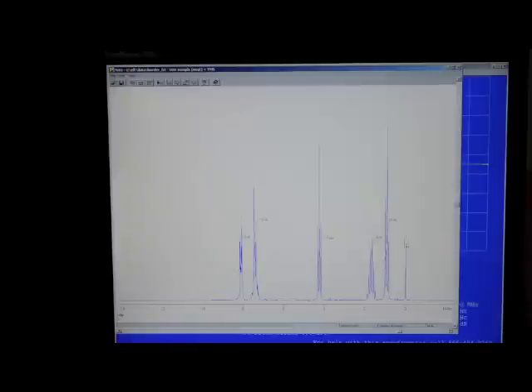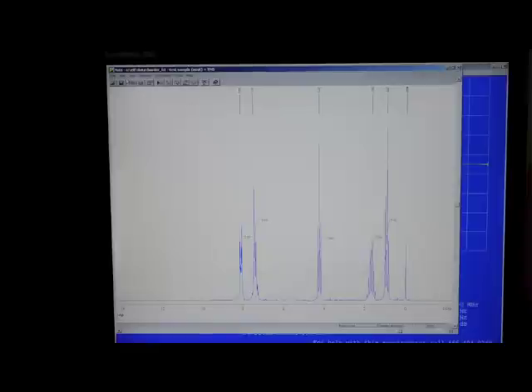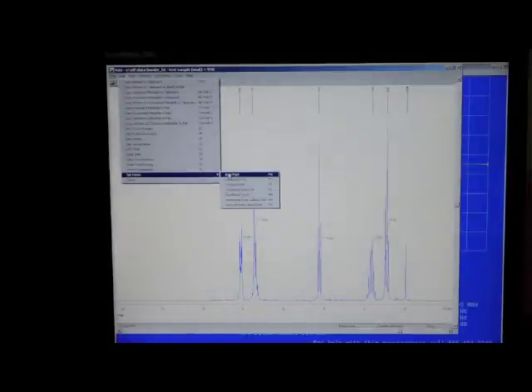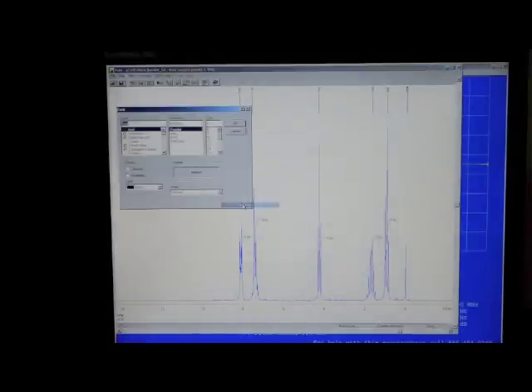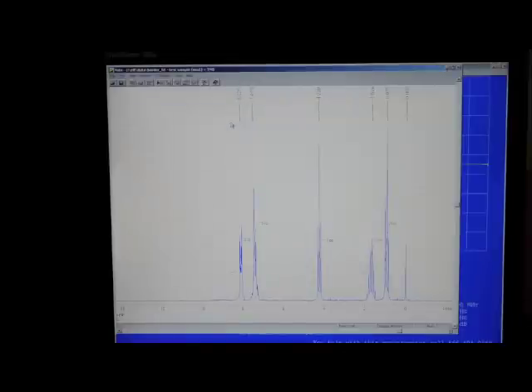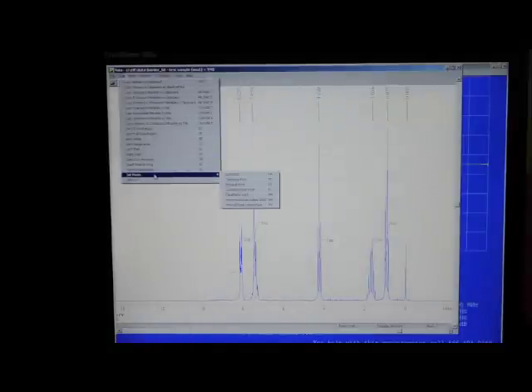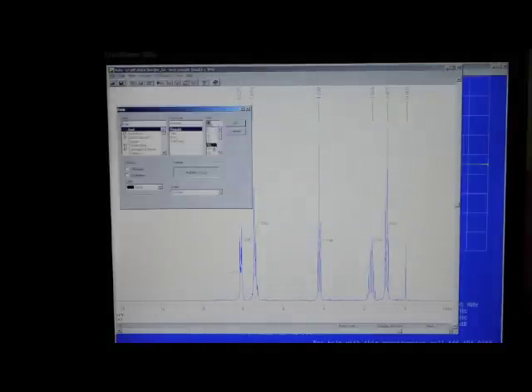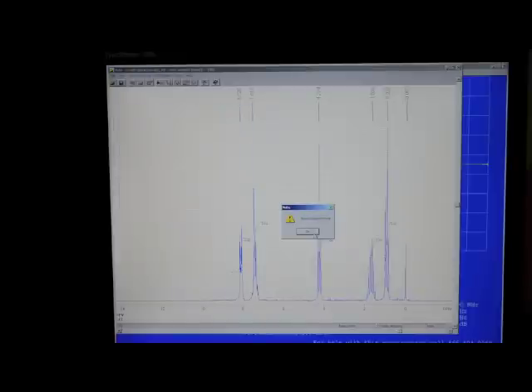Hold down the CTRL key and press P to display the peak PPM values. You may wish to change the font size for the display. This can be done by selecting Set Fonts in the Edit menu and then choosing the specific types of display fonts that you wish to change.